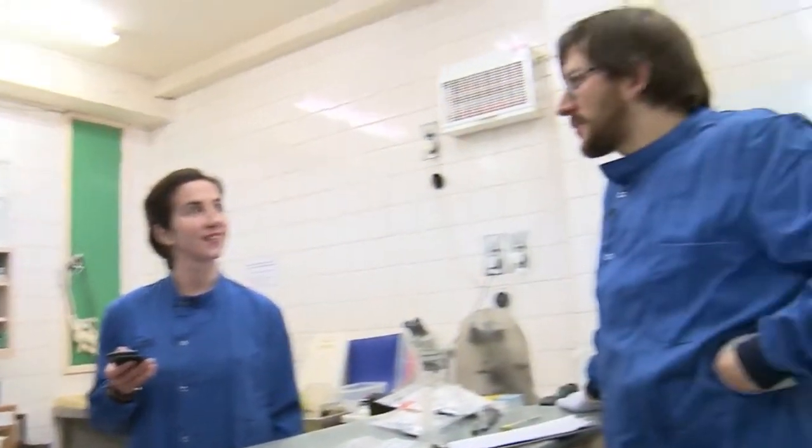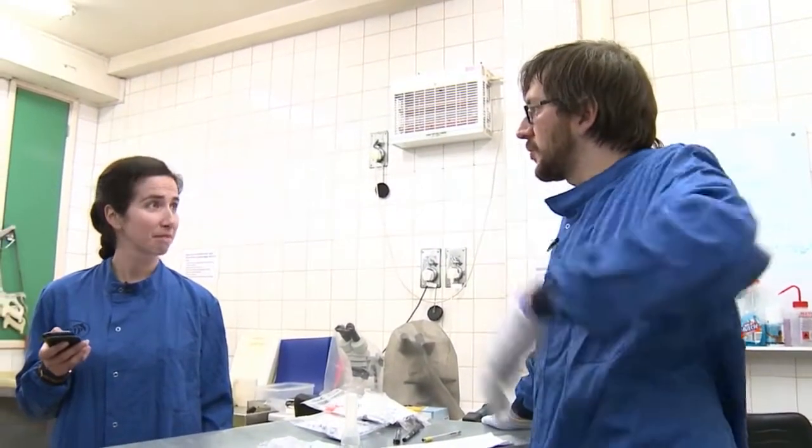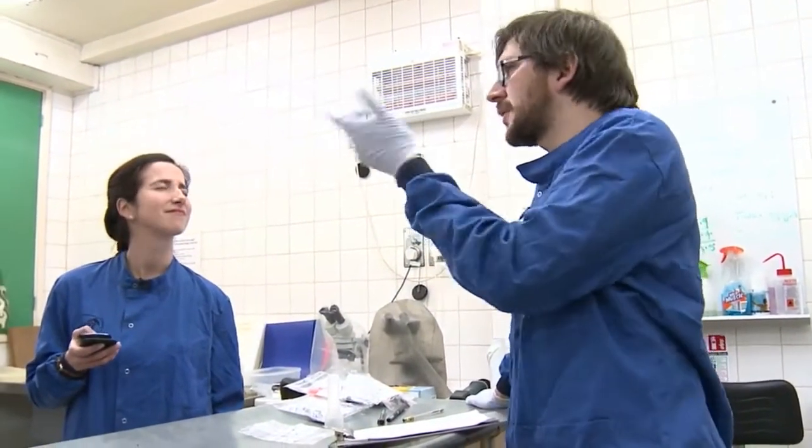Not really. In the Thames whale, they found a potato in the stomach. Oh, really? Yeah. So we presume that obviously it was ingested, it was actually in the shallows of the water, so debris floating around. We found crisp packets before, but only small fragments, nothing which would have actually caused any issues. But I think potatoes are the strangest thing I can remember.